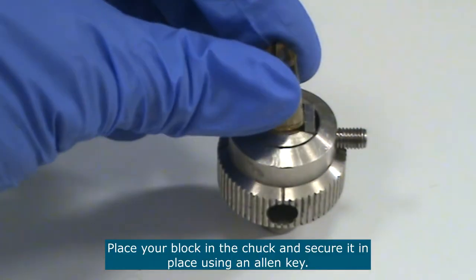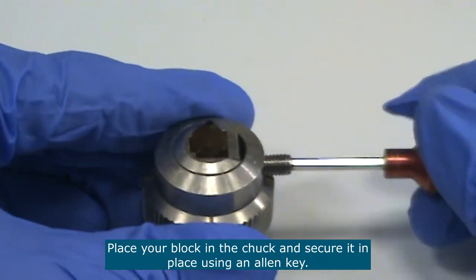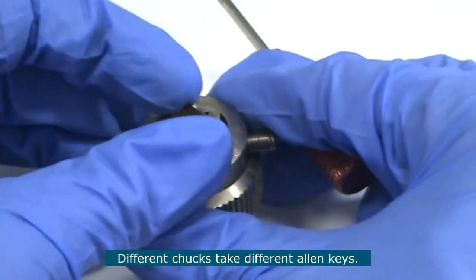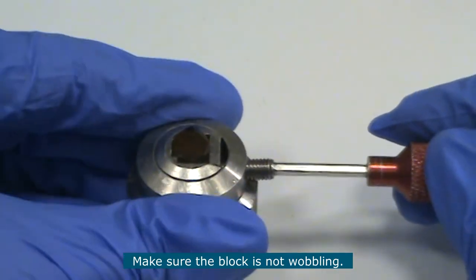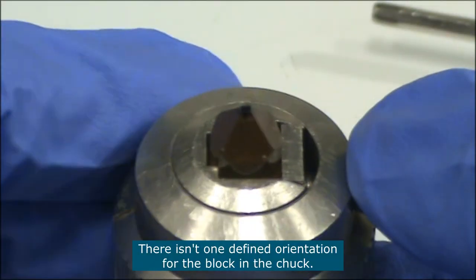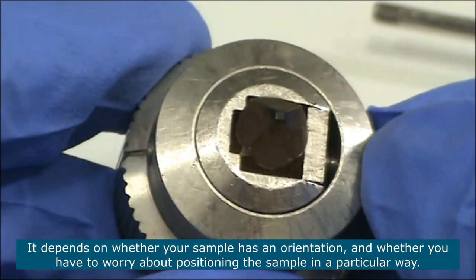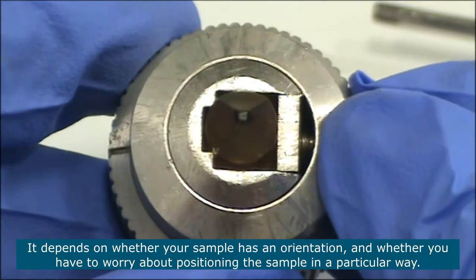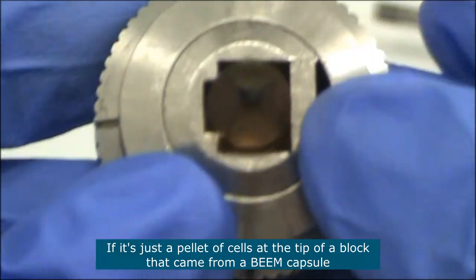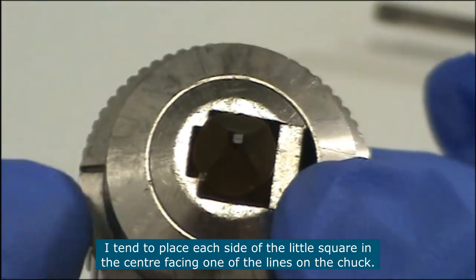Place your sample block inside the chuck support and then secure it in place using an allen key — it might have to be a different allen key depending on the support, as they don't all take the same size. Make sure the block is not wobbling so it is nice and secure. There really isn't one defined orientation you should use for the block inside the chuck, as it depends on whether your sample has an orientation. If it's just a pellet of cells at the tip of a resin block from a beam capsule, I tend to place each side of the square in the center facing one of the lines on the chuck.